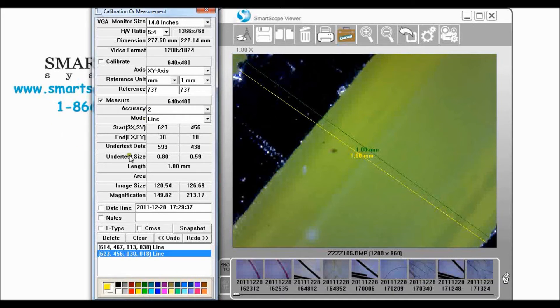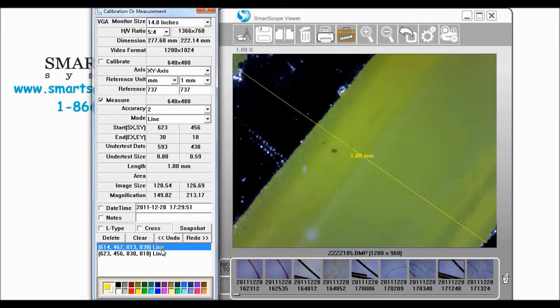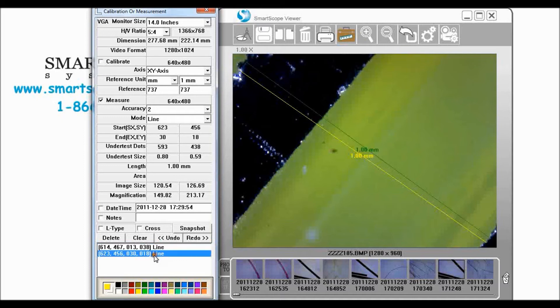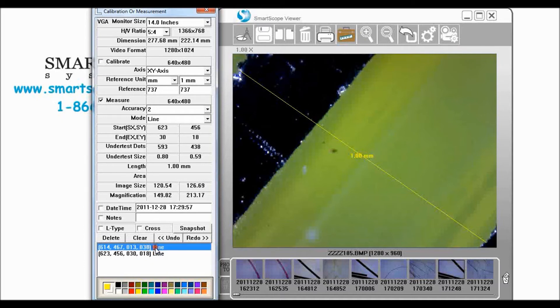So now we're calibrated. Before we come out of this though let's say I wanted to, I viewed these lines but I made a mistake on that one so I want to remove it. Well I can click delete and then that line is gone.